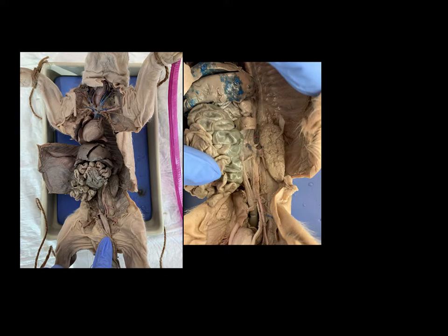This is the left renal vein. The left renal vein is the vessel that drains blood out of the kidney. And even though we don't see it, we'll see it in just a moment, there's a blood vessel that's running down through here that this left renal vein is connecting to, and this is the inferior vena cava.